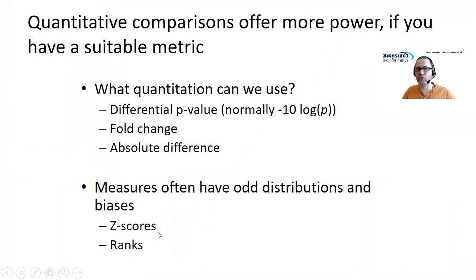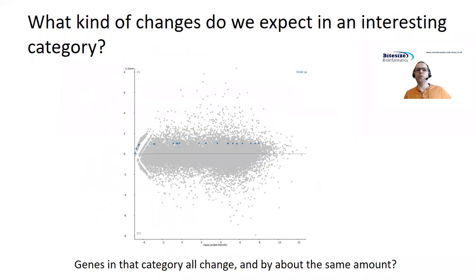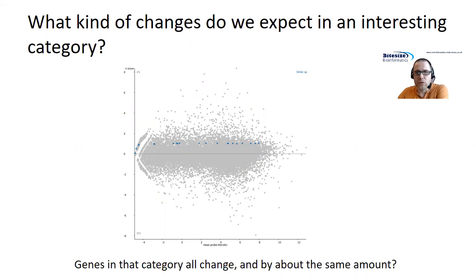Rather than just using the difference between the two, we're going to use a normalized version of that difference. We're going to apply a Z-score normalization to make those values fairer between genes that are lowly and highly expressed. When we come to testing a functional set of genes, we're going to take lots of sets of genes — we'll pull out a database with lots of different functional sets defined in it and test all of them.